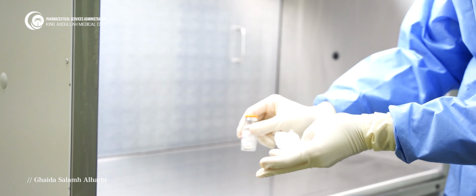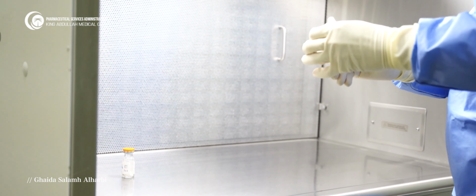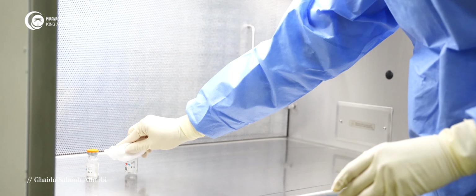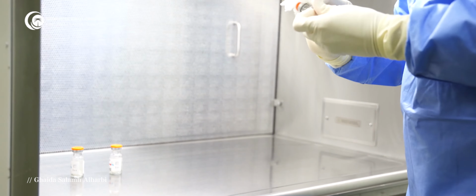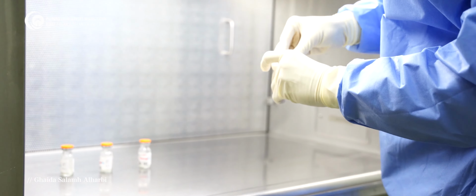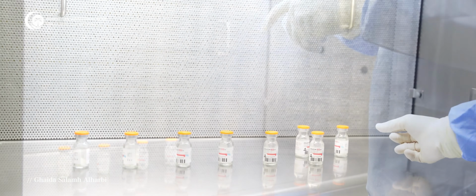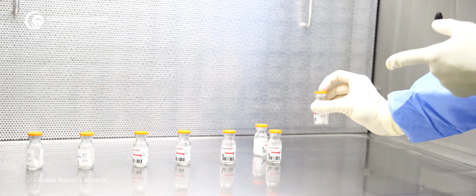This video will be about starting compounding inside the ISO class 5 environment. Before you introduce any item inside the ISO class 5 environment, you shall wipe with an appropriate disinfectant. The arrangement of items inside the ISO class 5 is very important.